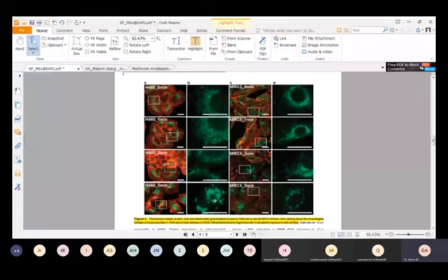And in this 5-minute plasma treated sample, the mitochondria are not the way they were in control, where they were in tubular form. You can see they were arranged around the nucleus. Here in the middle is the nucleus, and these mitochondria were arranged around the nucleus. However, in the treated sample, they are scattered. So we cannot really observe the tubular appearance of the mitochondria around the nucleus in this sample. So from this, you understood that by applying this staining technique, we can see the morphological changes in mitochondria.